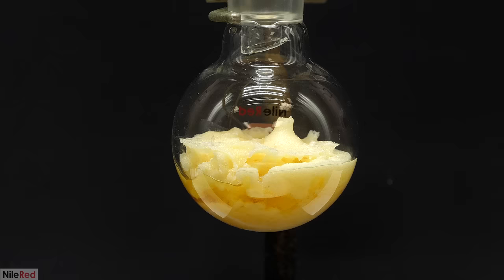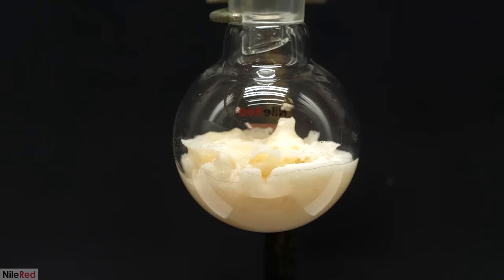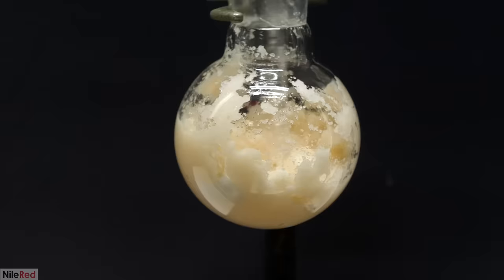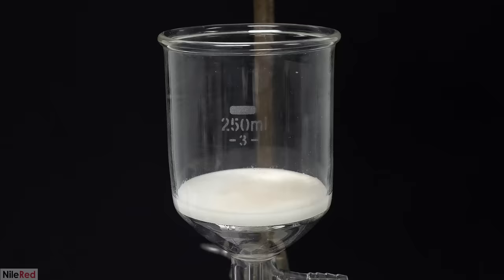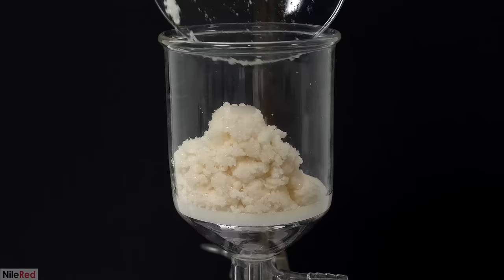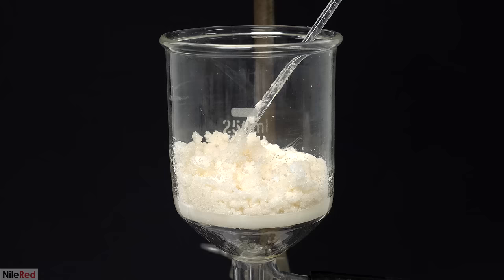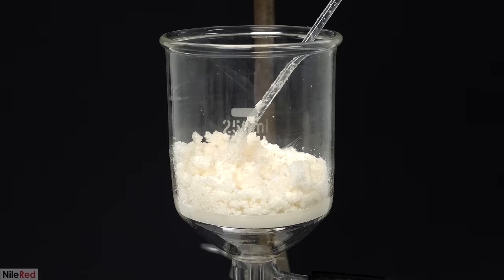As it cooled down, the yellow color slowly faded, and by the time that it was room temperature, it was mostly white. I broke it up as best I could with a glass rod, and then I transferred it all to a filter funnel. It really didn't look like there was much or any solvent left over, but it was all still there, and it was just stuck to the solid. So when it was all added, I turned on my vacuum pump, and you can see that quite a bit of liquid was pulled out. I let the pump run for a few minutes to dry it up as much as possible.